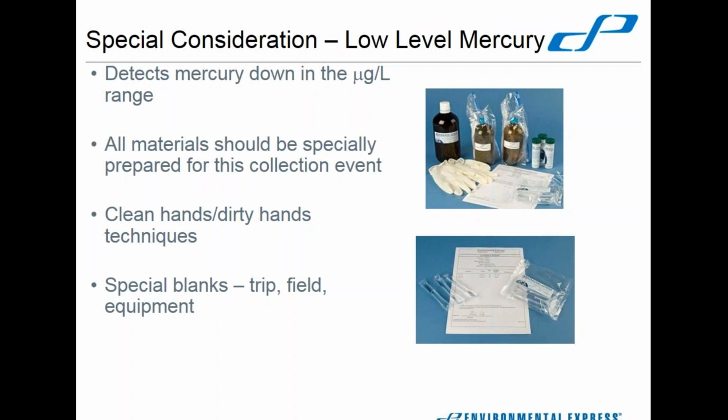It uses the clean hands, dirty hands technique. Usually you have to have 2 people there, one person who's got the dirty hands, who is actually going to be handling everything, opening containers up, opening bags up, doing all of that, and then one person with the clean hands who is only handling the sample itself. And that's to make sure that you keep things as clean as possible.